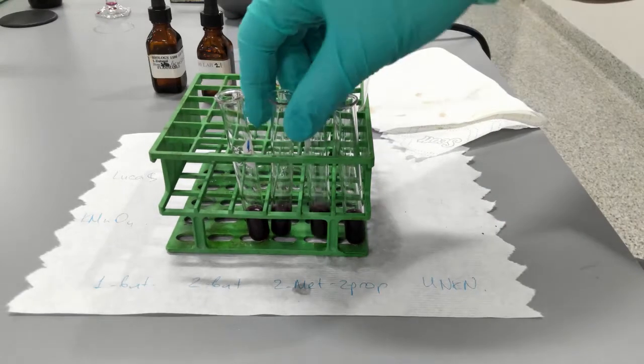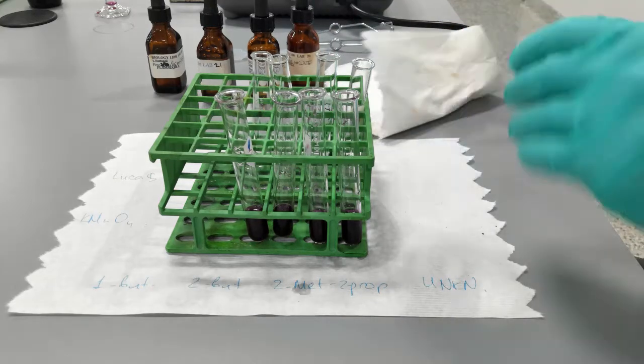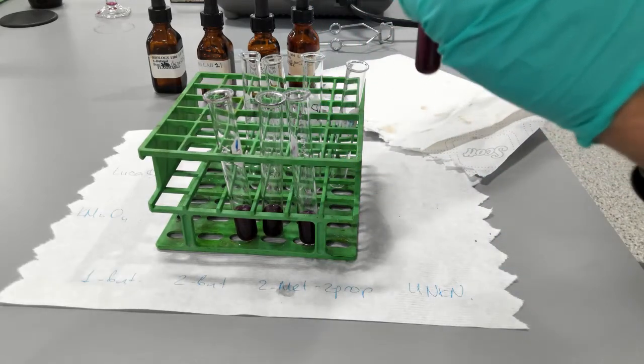Now let's compare this. I don't see any difference. Well, we're going to try and add some more alcohol to these tubes. This is tube 4.